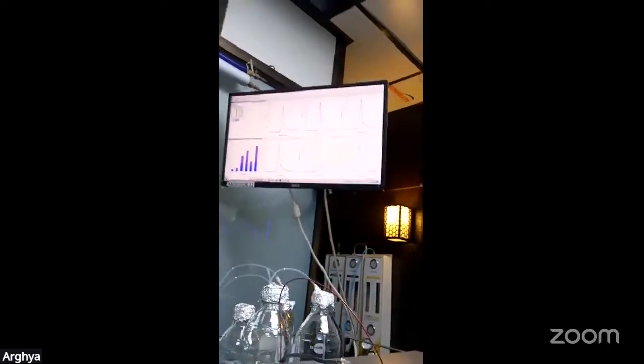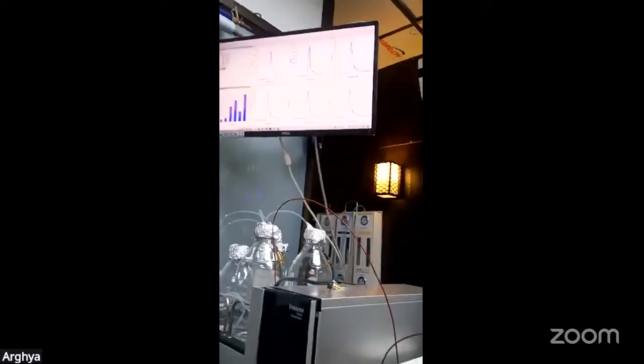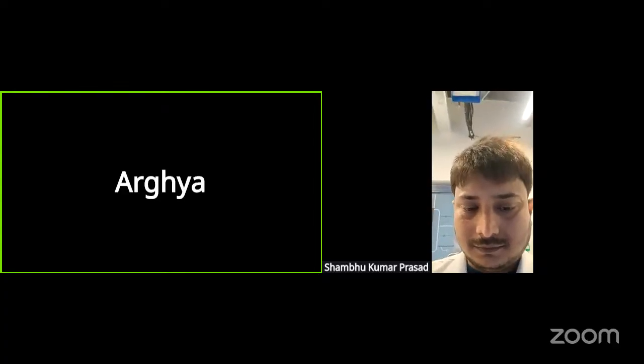So I think there is one more mass spec that Dr. Shambhu is going to introduce. Dr. Shambhu, you can be fast and crisp. In addition to various types of Orbitraps, which you have just seen, we also have a 4D omics technology, which is the timsTOF. So Shambhu, please share your video now. I'll add in spotlight. Yeah. Please show the timsTOF and talk about it.